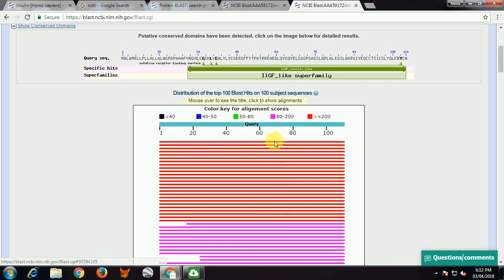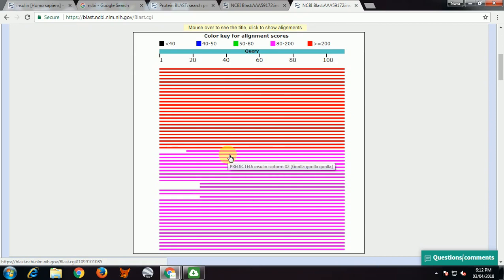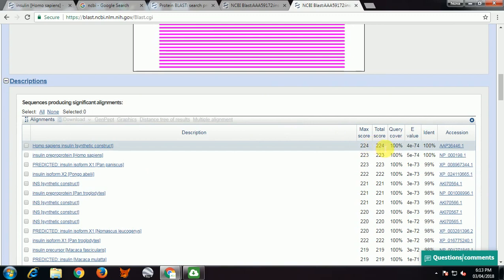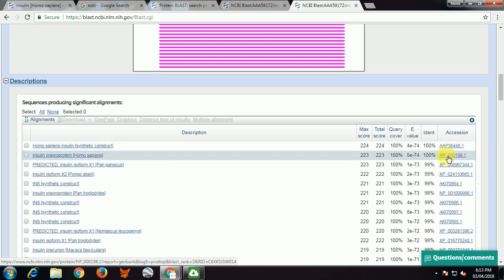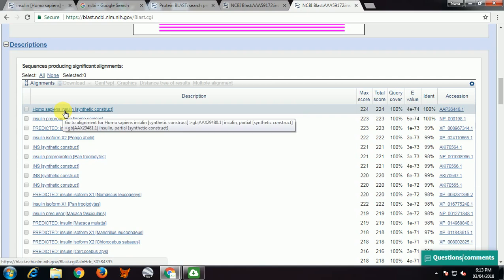If the score is red, that means alignment score is more, so identity and similarity are higher for those particular sequences. Each single line represents a particular sequence in the result. As the score goes from right side to left, alignment score decreases — identity and similarity go on decreasing, and gaps appear where alignment has not occurred. The first result shows query 100%, E-value, identity, and the accession number of the first sequence from the alignment.